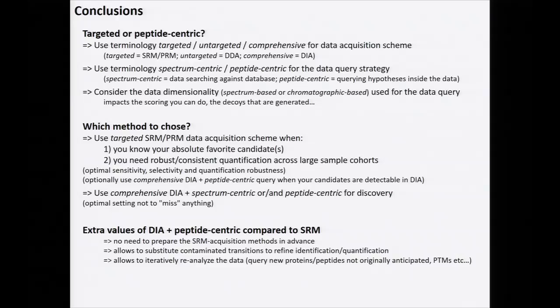So this happens very often now: you see that two peptides go up and one peptide goes down. So the question is, if I interrogate a fourth peptide of that protein, is it going to agree with the first two or with the third one? The one that disappeared, what happened to it? Was it miscleaved? Was it modified? You can search for the modification of that peptide. So there are basically unlimited things you can do with DIA data.